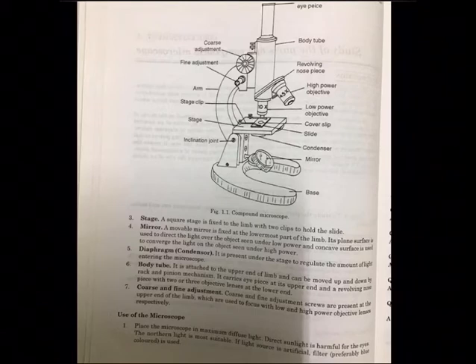Coarse and fine adjustment screws are present at the upper end of the limb, which are used to focus with low and high power objective lenses respectively. So, how to use the microscope? Place the microscope in maximum diffuse light.